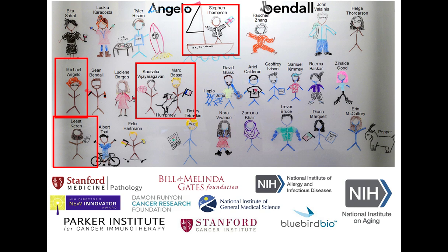So let's get started. Our first question is, can you provide more detail on the sample preparation, such as section thickness? Sure. That's an interesting one with the brain samples in general. Everything that we showed in this presentation was 5-micron tissue sections, and that, as I understand it, working with the neuropathology team at Stanford, is pretty standard.